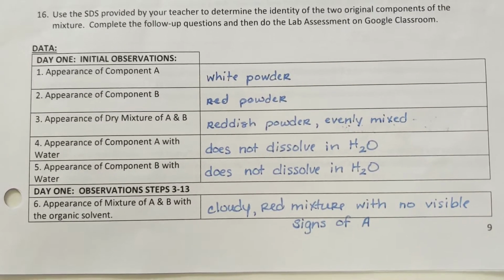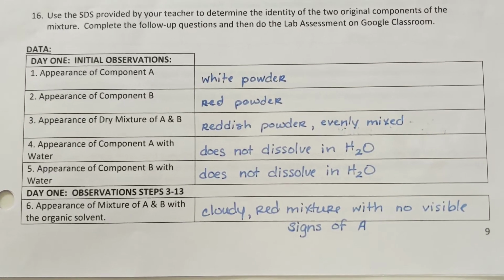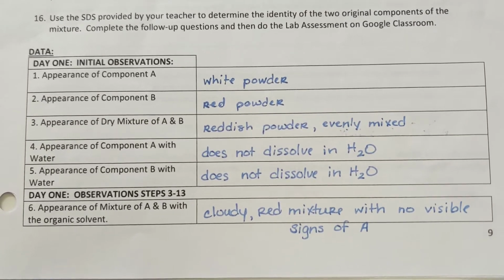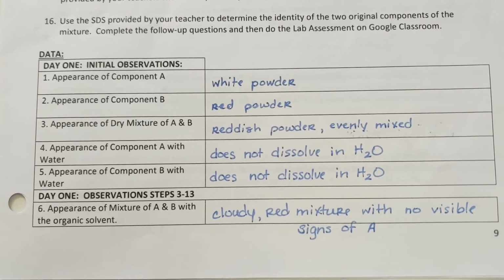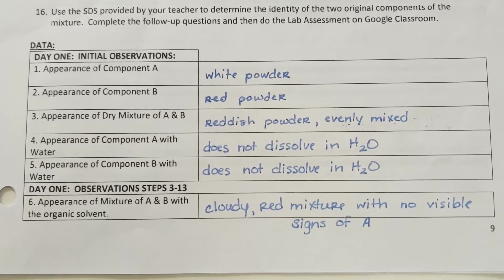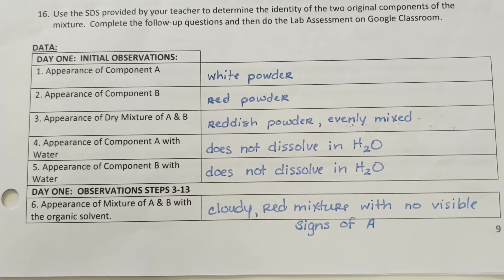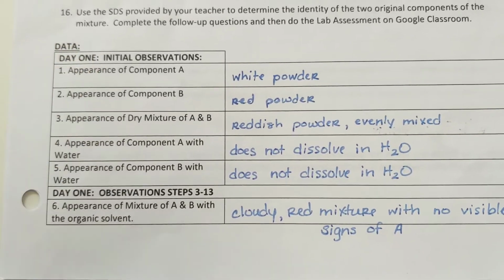We also on day 1 observed the mixture in the flask with some solvent. It was the organic solvent. So we should have seen that we had a cloudy red mixture. The fact that it was cloudy and red makes me realize that the red substance B, component B, is not dissolved. And there's really no visible signs of A, so A is probably dissolved in that solvent at this point in time because you don't have any sign of it in the mixture.